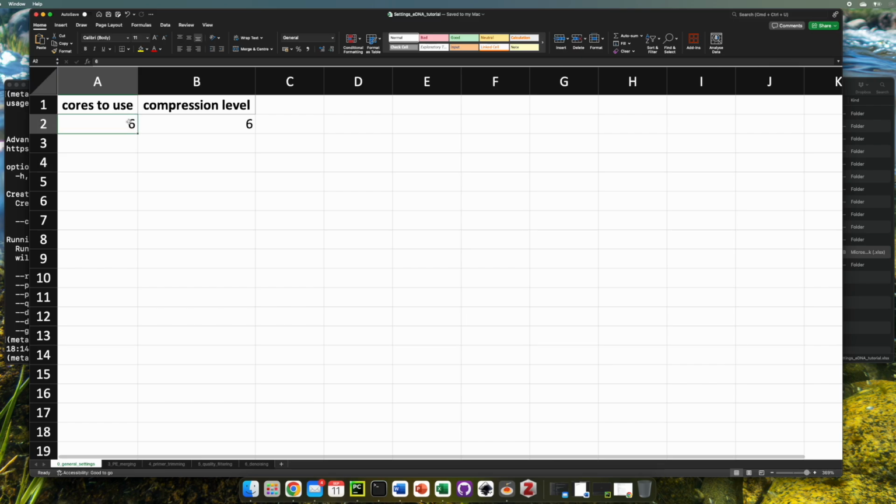So here, if you leave it by default, it will be your number of cores from your PC, a little bit adjusted so that there are some cores left so that your PC is still functional, but I would still recommend to use the maximum number, which is the default number here if you're working on your local PC. So just leave it like that and don't do any other work intense steps during the analysis. If you're on a server, I would recommend not using all the cores unless you have the server for yourself.